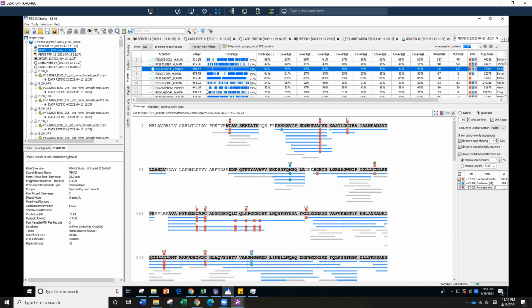For this project, I'm working on an EDTA experiment that will chelate out the iron from the transferrin. So transferrin is what I'm interested in. I come here and search for it first. I bring it up and it tells you it has a good p-value, 79% coverage, and all of the peptides are unique to itself.